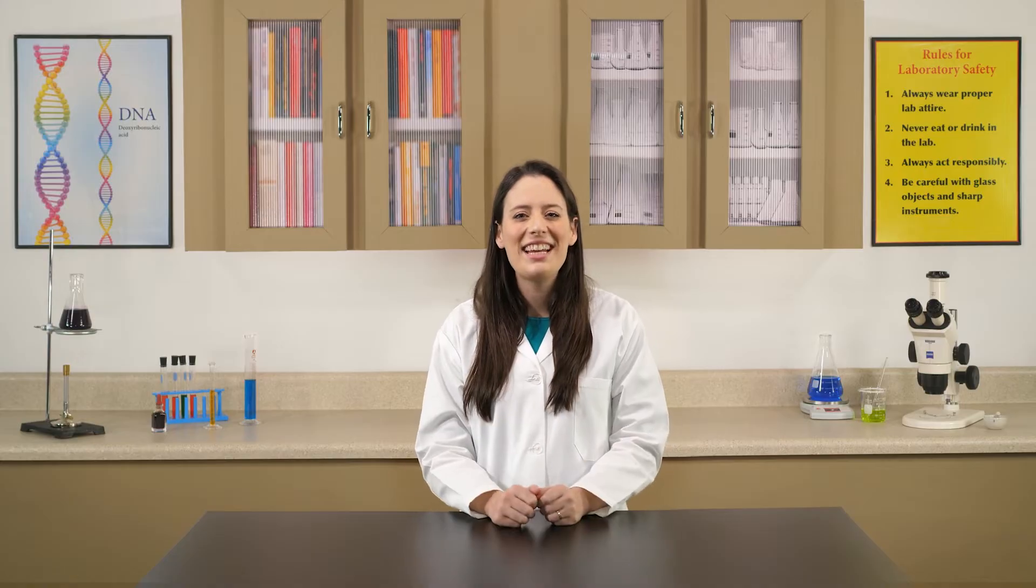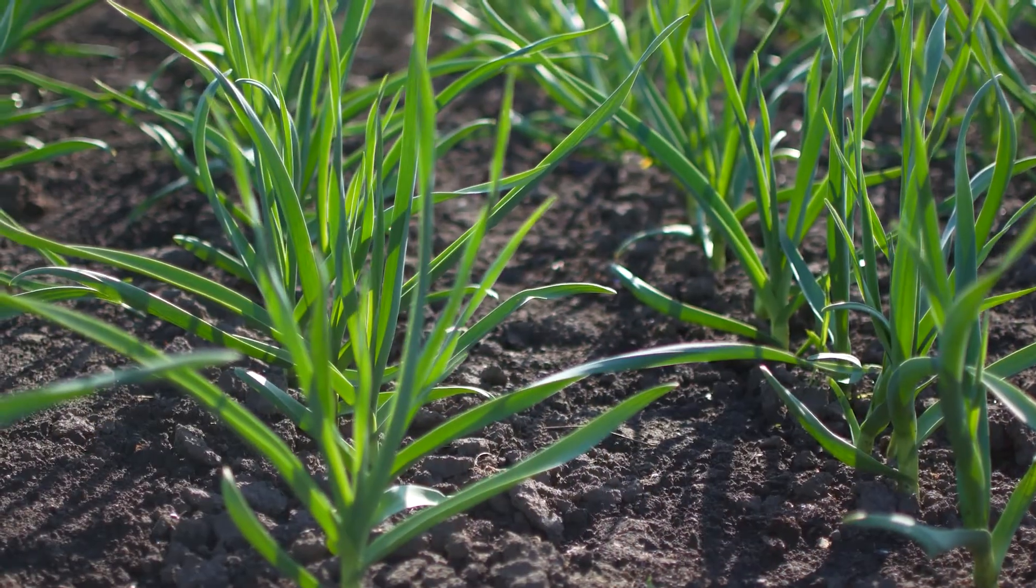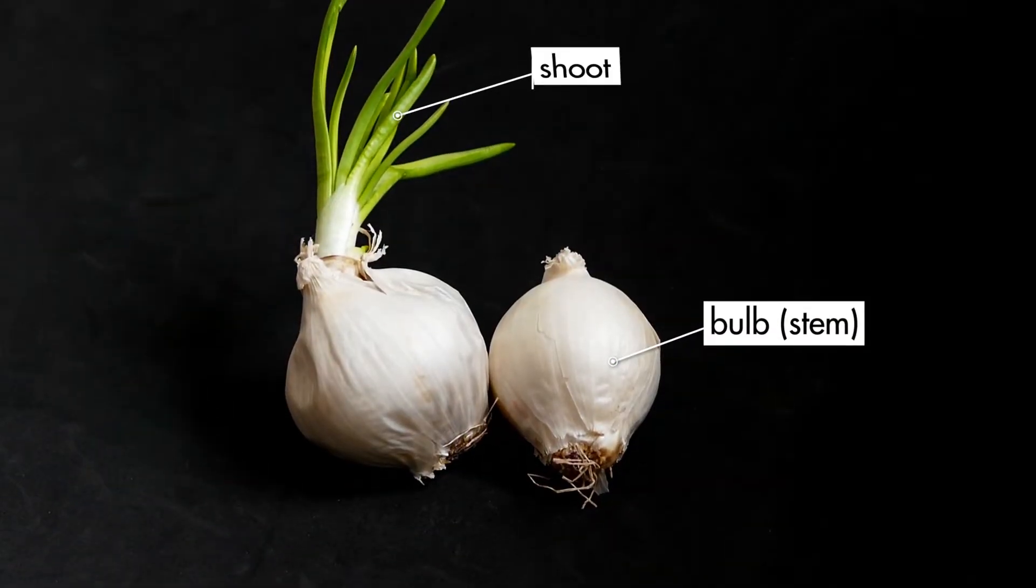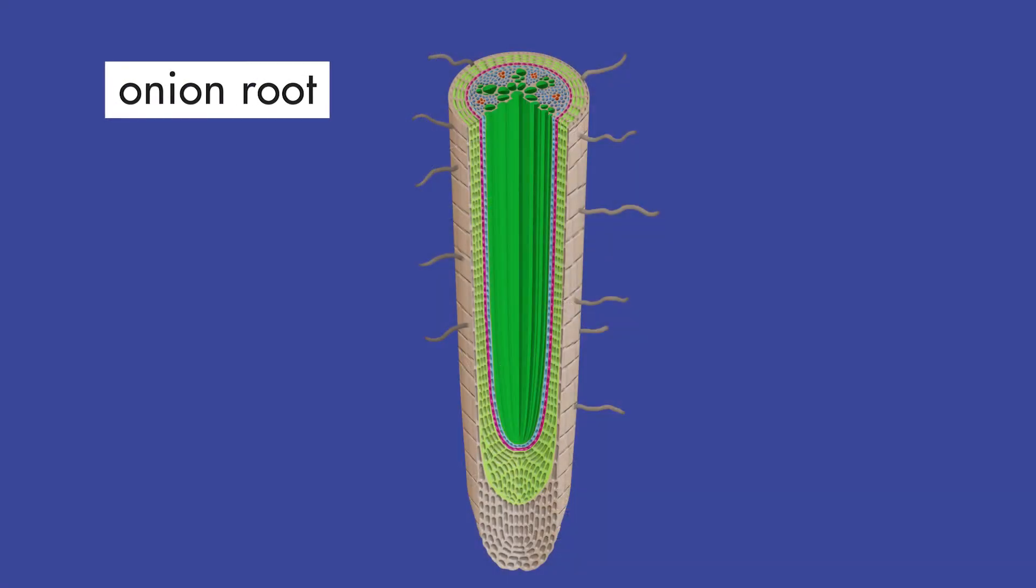In this lab, we will prepare a microscope slide containing a sample of onion cells and examine the cells in each phase of mitosis. The bulb of the onion is a type of stem that grows underground. The region near the tip of an onion root is called the apical meristem. The cells in the apical meristem were actively growing and dividing when the plant was alive, so we should be able to see cells in the various phases of mitosis when the root tip is examined under a microscope.